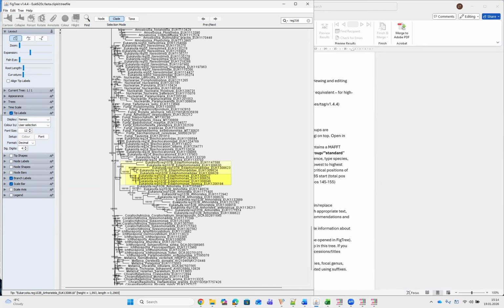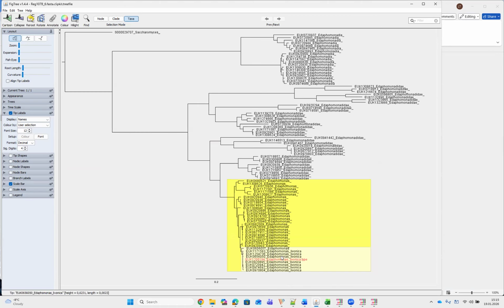This tree you need to get the sequence accessions for particular target taxa. There is also another tree about this particular group. Here is the genus or species, the whole genus, family, and also the rest of the phylum, which is quite distinct and has a long branch.